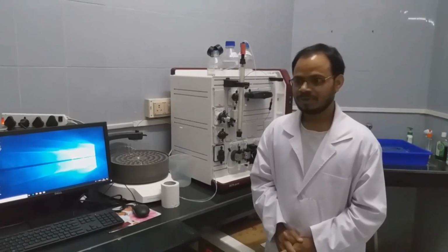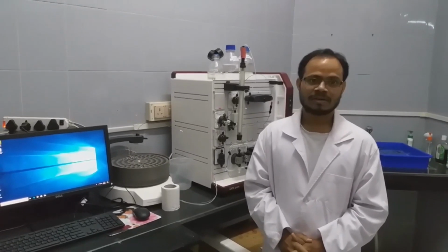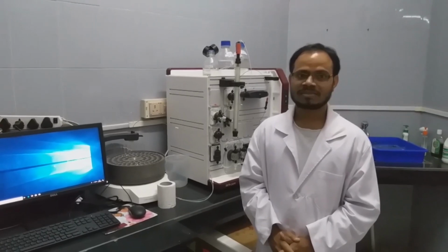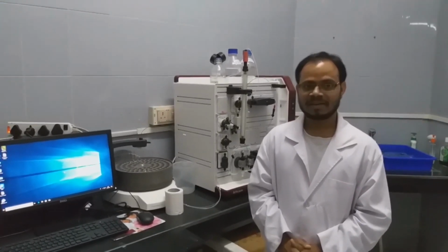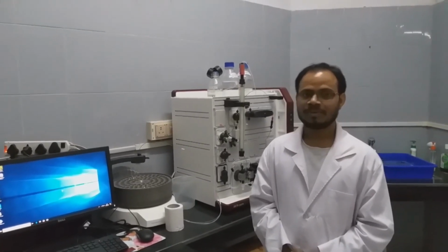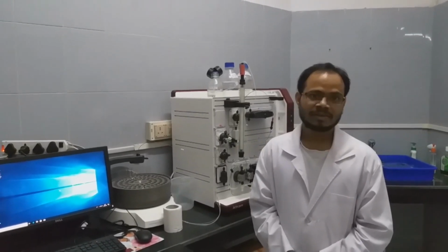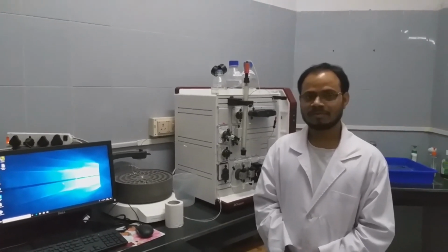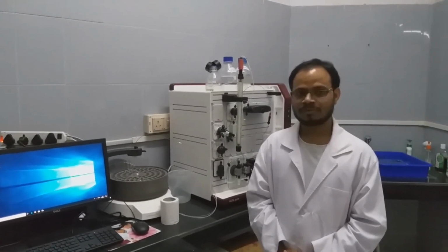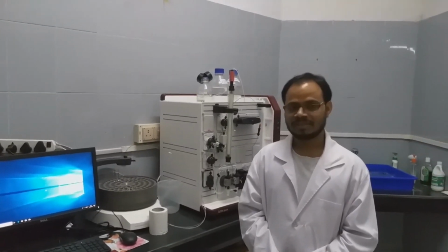The main reason is that if you use stainless steel columns in FPLC, because of the high concentration of salts and different materials we use, it may corrode the steel. So there may be improper separation of the components which we want to separate. That's why we use only plastic columns in this one.